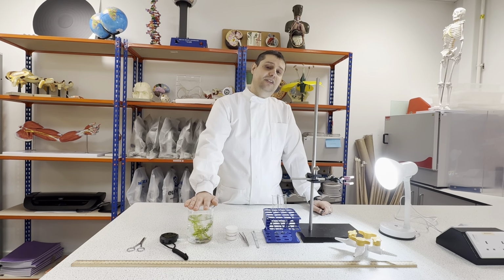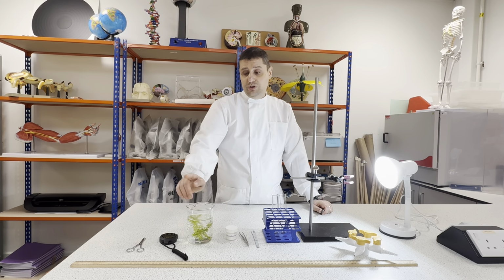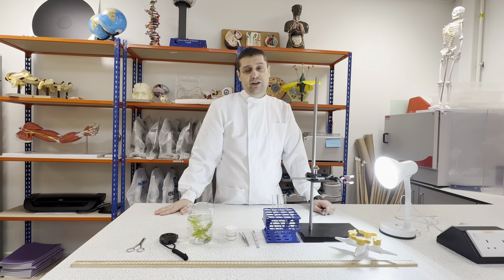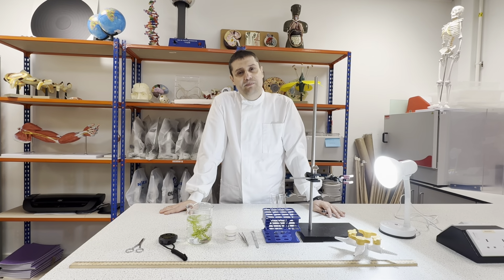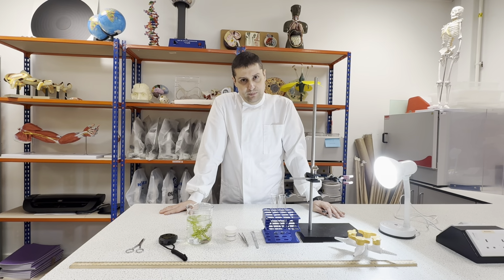For this activity, I find it better and simpler to use Elodea, which you can easily find in any pet shop in the UK.